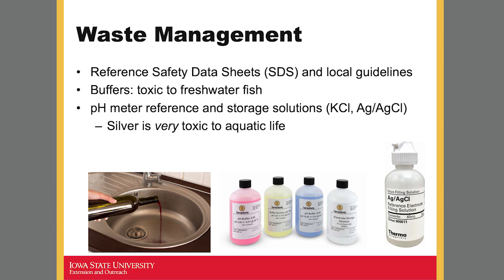And then the solution that goes inside the probe, the reference solution, is silver chloride. And silver is very toxic to aquatic life, so make sure you keep track of that. Check with your local guidelines. Hopefully there's some sort of program that you can collect this waste and bring it somewhere if you need to, or they'll tell you how to neutralize it and destroy it on site. With that, I'm going to switch over to the demo portion.